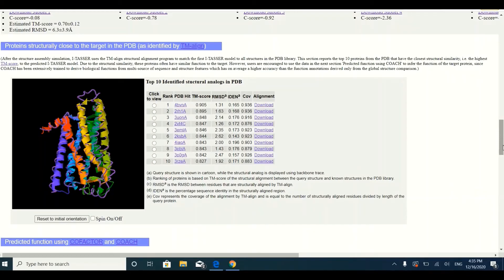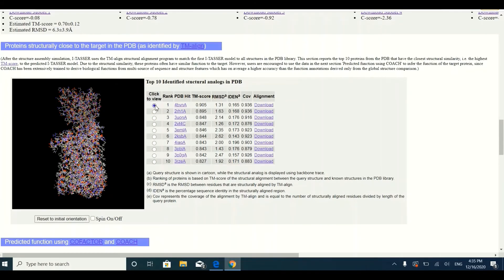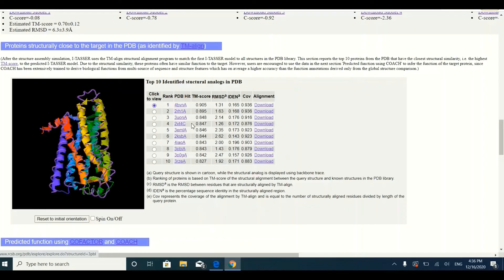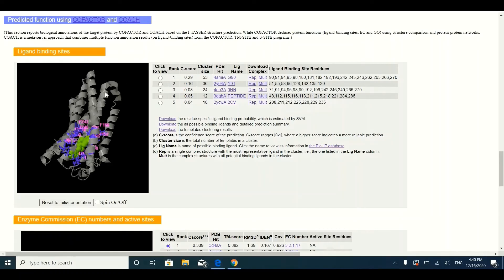Below the three-dimensional structure prediction models, you will find the alignment of your predicted structure with the templates. You can see the templates used for prediction. If you want to align the three-dimensional structure predicted by I-TASSER onto a template, you can simply click on the radio button. This will show you how accurately your protein's predicted structure aligns with the template, giving you a good idea of the structural similarity between your predicted structure and the template used.